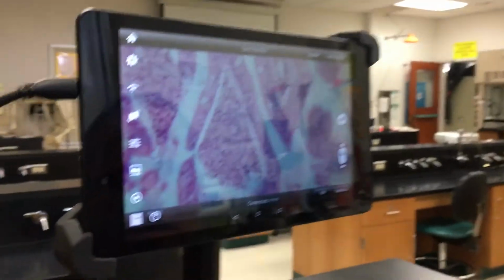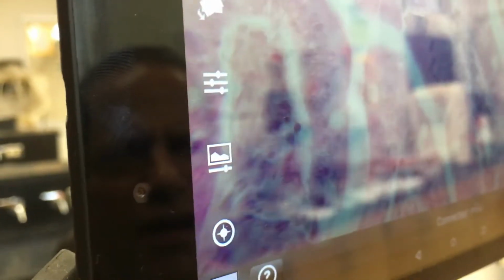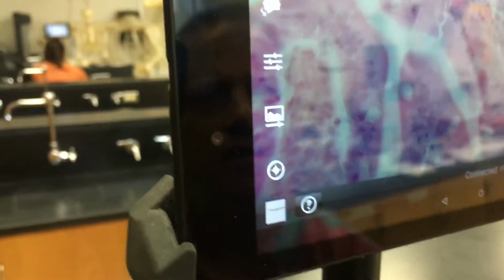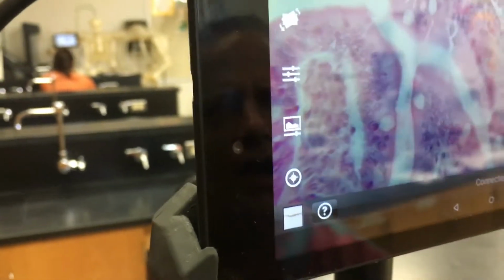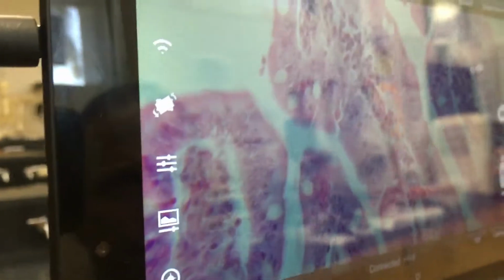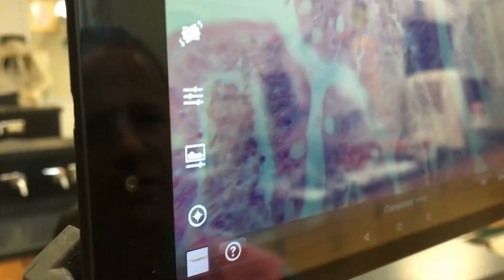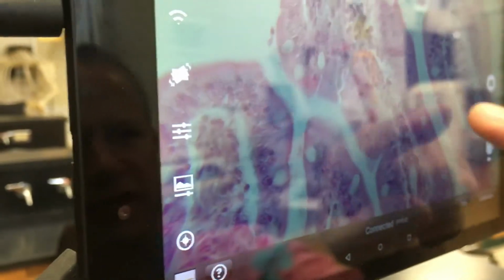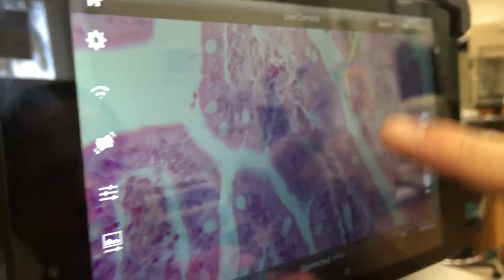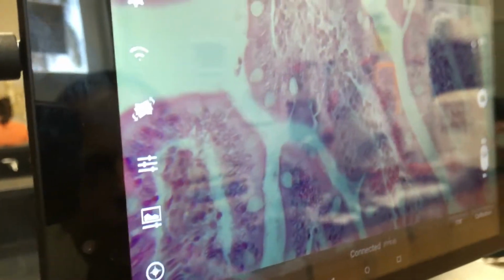Are they simple or stratified? They are stratified because there's no... Since it's a top-down view. No, it's not. I know they do look stratified. They're probably mostly simple, but it is hard. It does look like there's pseudostratified or something going on. It could be. Okay. These right here look simple to me. These do look stratified. I'm not going to give you one that's really difficult to tell.